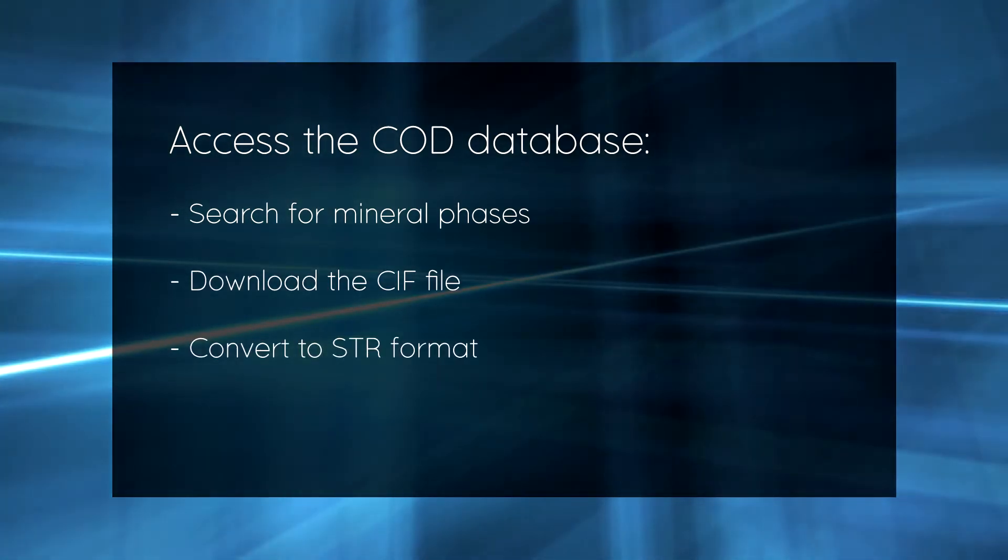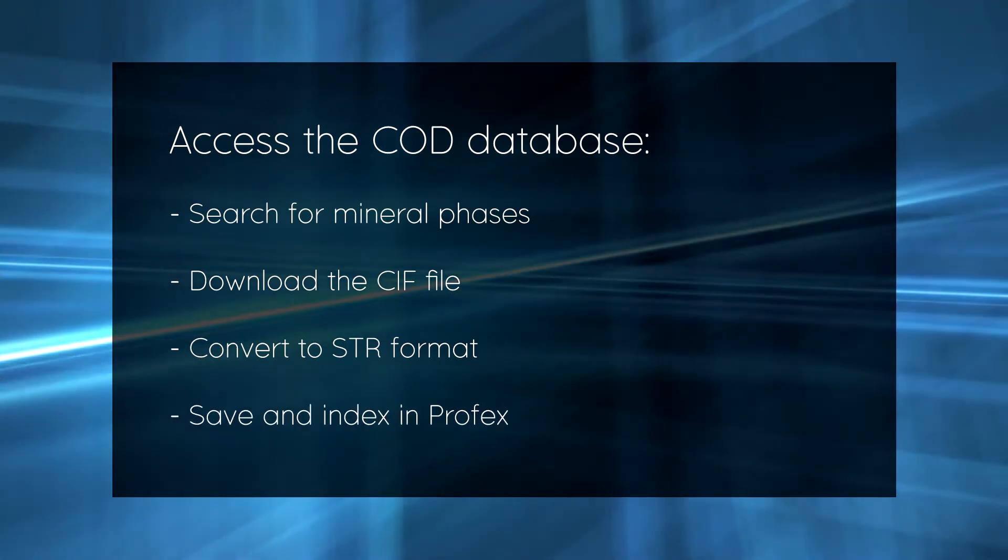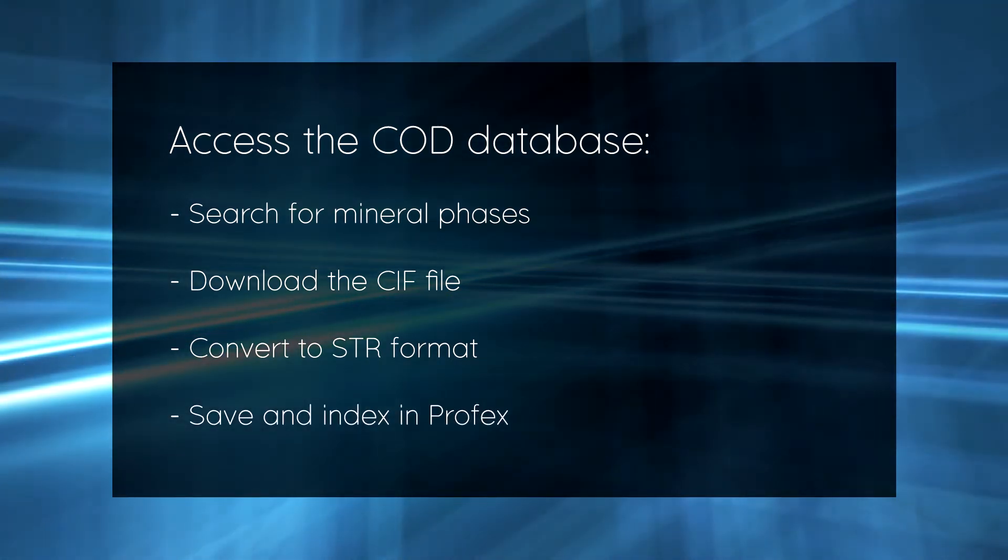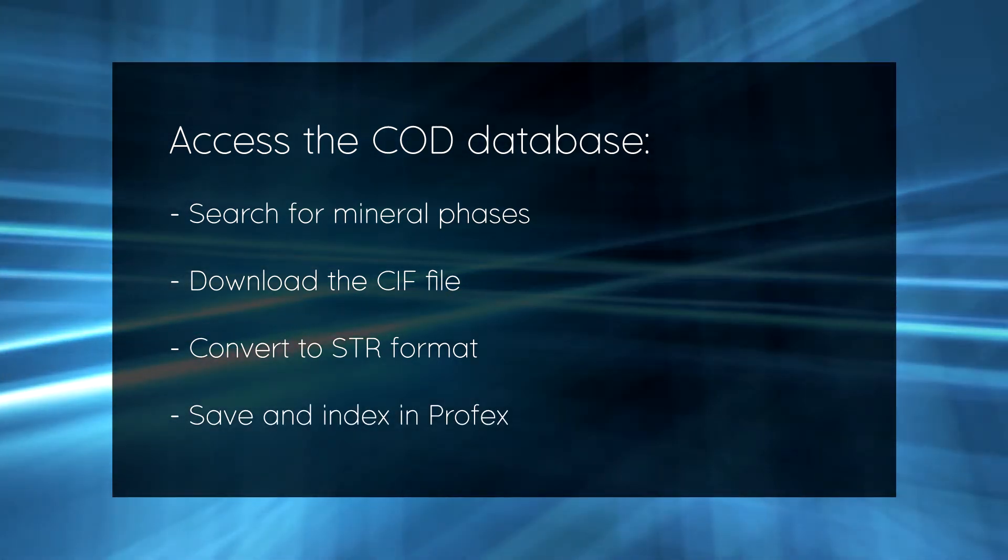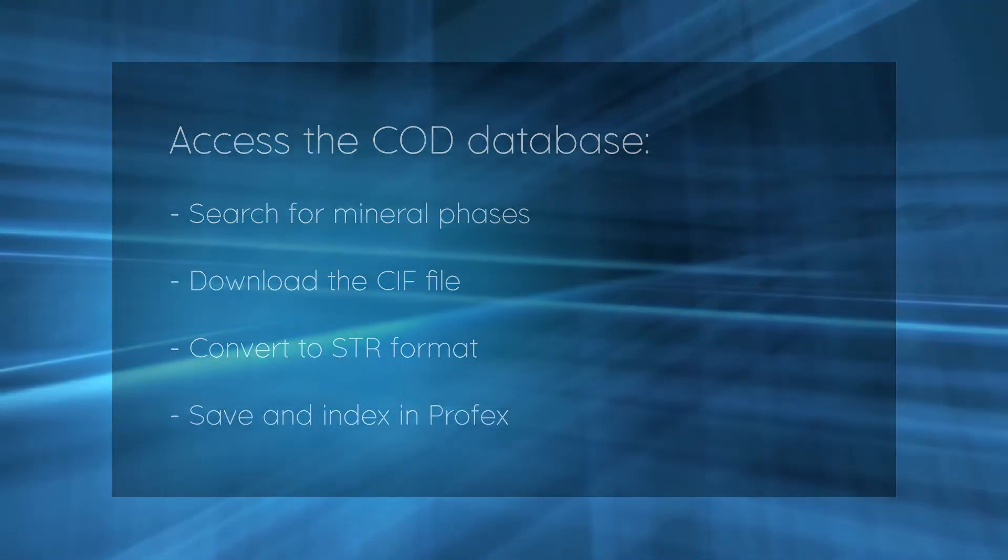But we need to download the database, install it locally, and set up Profex accordingly. That's what I want to show in this video.